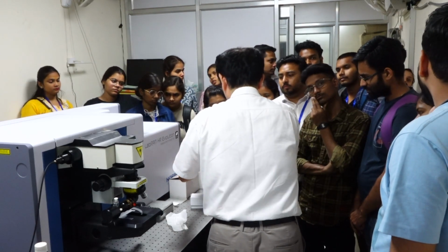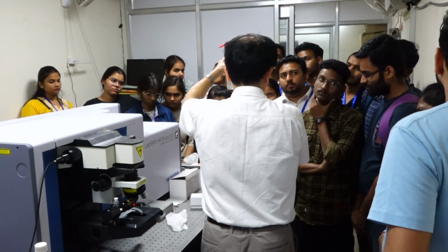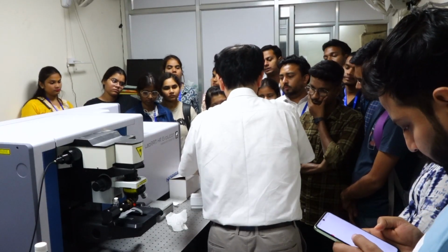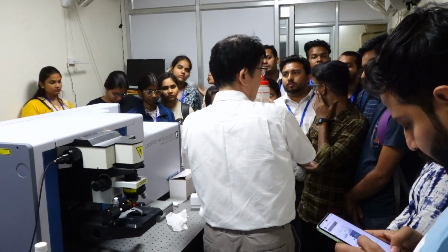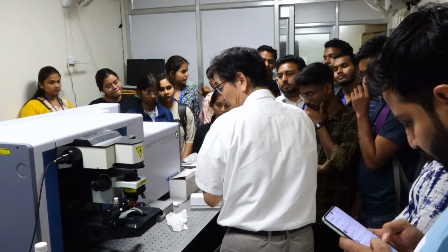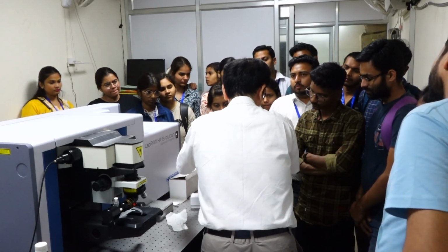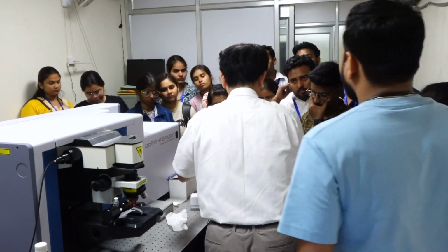So in the case of 90-degree scattering, we need to focus the laser onto one point by tuning this lens, and also we need to set the collection optics to the appropriate position. So we need two optics. In this setup, only one element is used. So the good point for the excitation is always the good point for the signal collection. In that sense, this is advantageous.